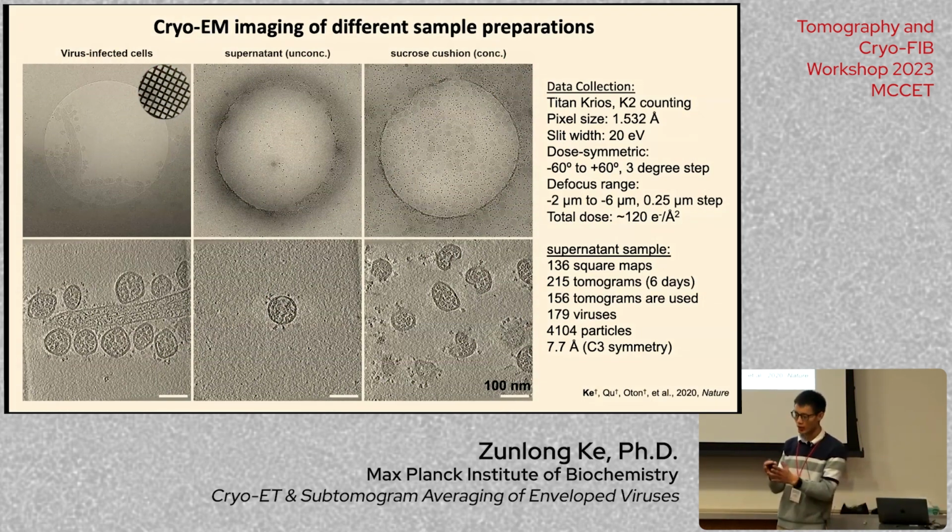That means you do a time course experiment of the infection, and you get the maximum assembly events in your sample. Go back to your biochemistry or virology or cell culture, to boost the chance. Then you have a better chance to look for what you want.